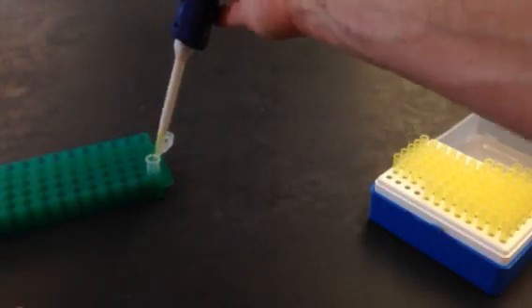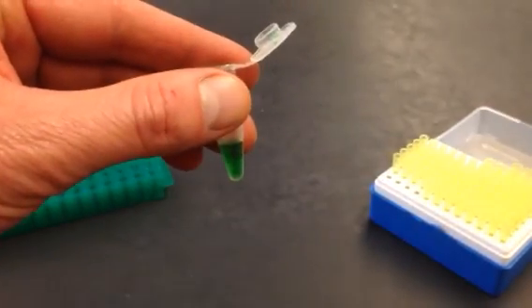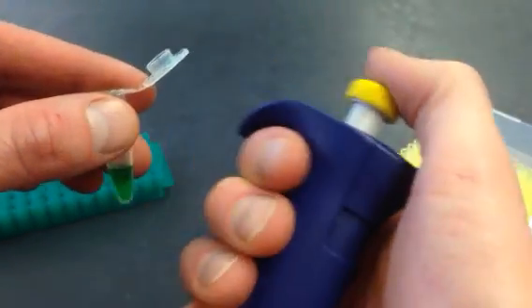A lot of people try and do this with the liquid still in the rack down there, but it's really important that you get it right up here where you can see exactly what you're doing. Okay, so now I'm ready to go.